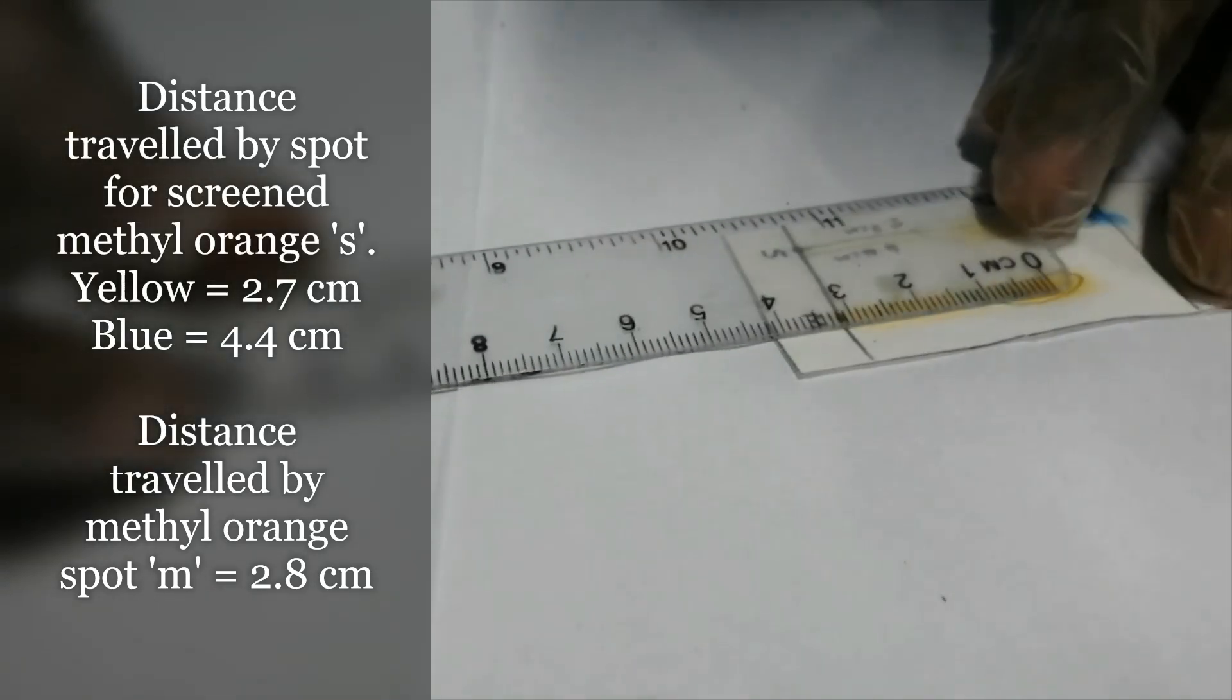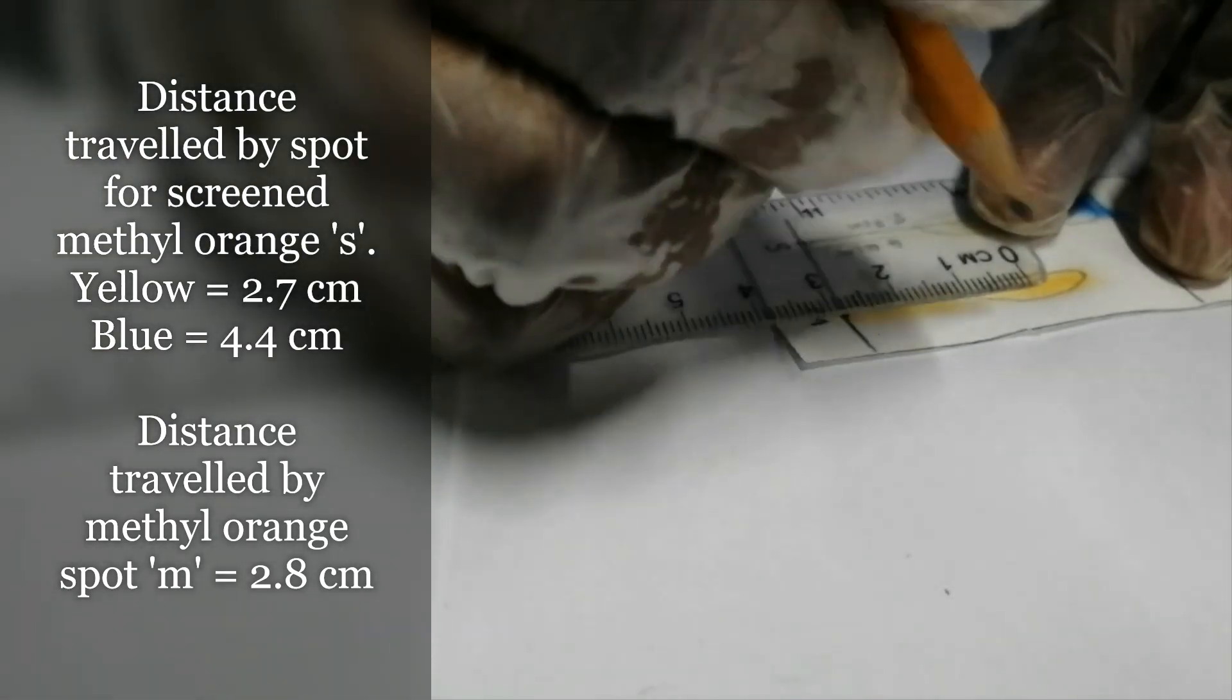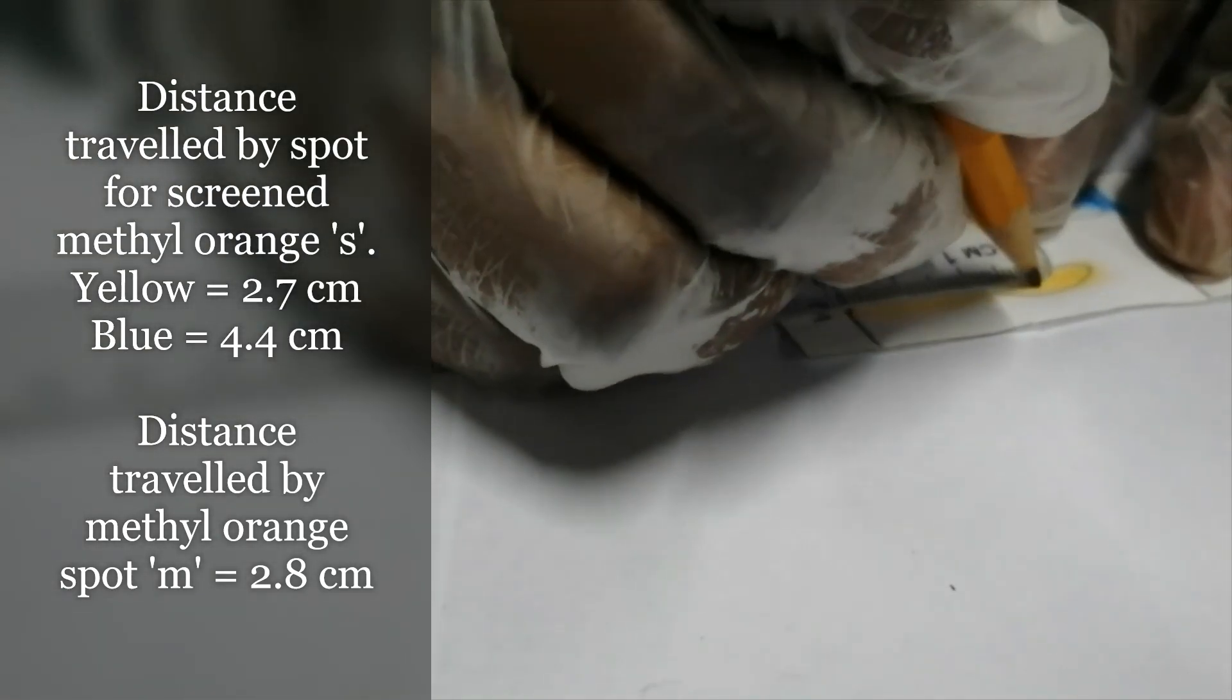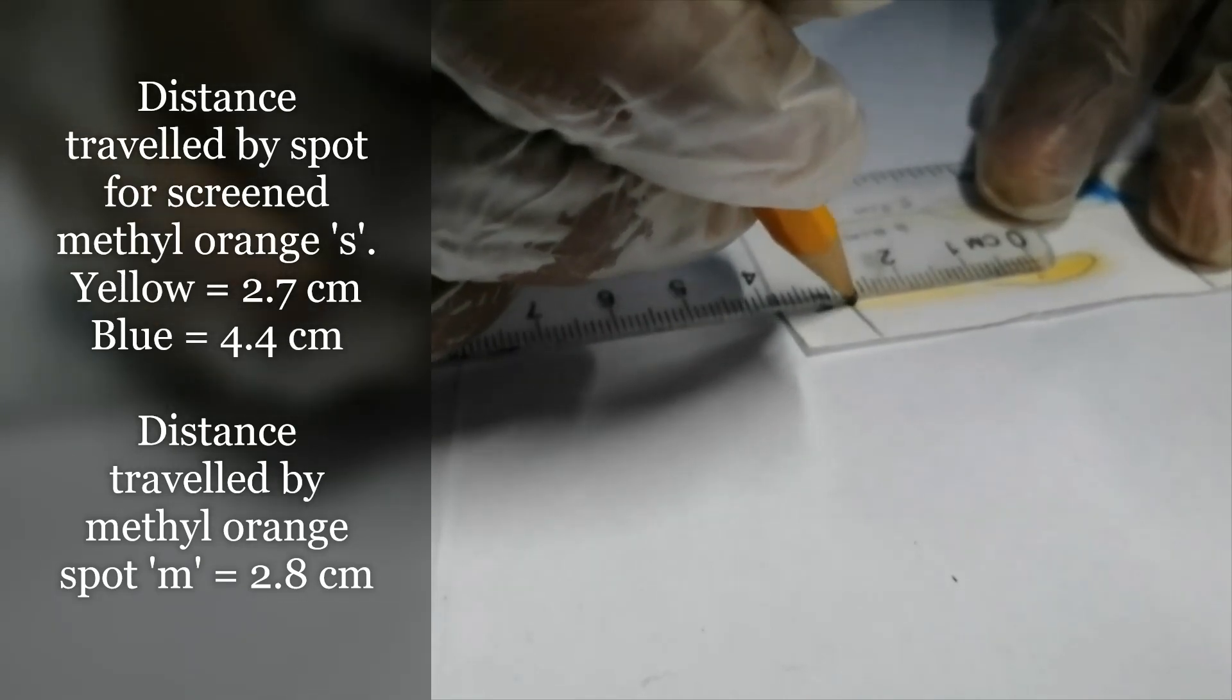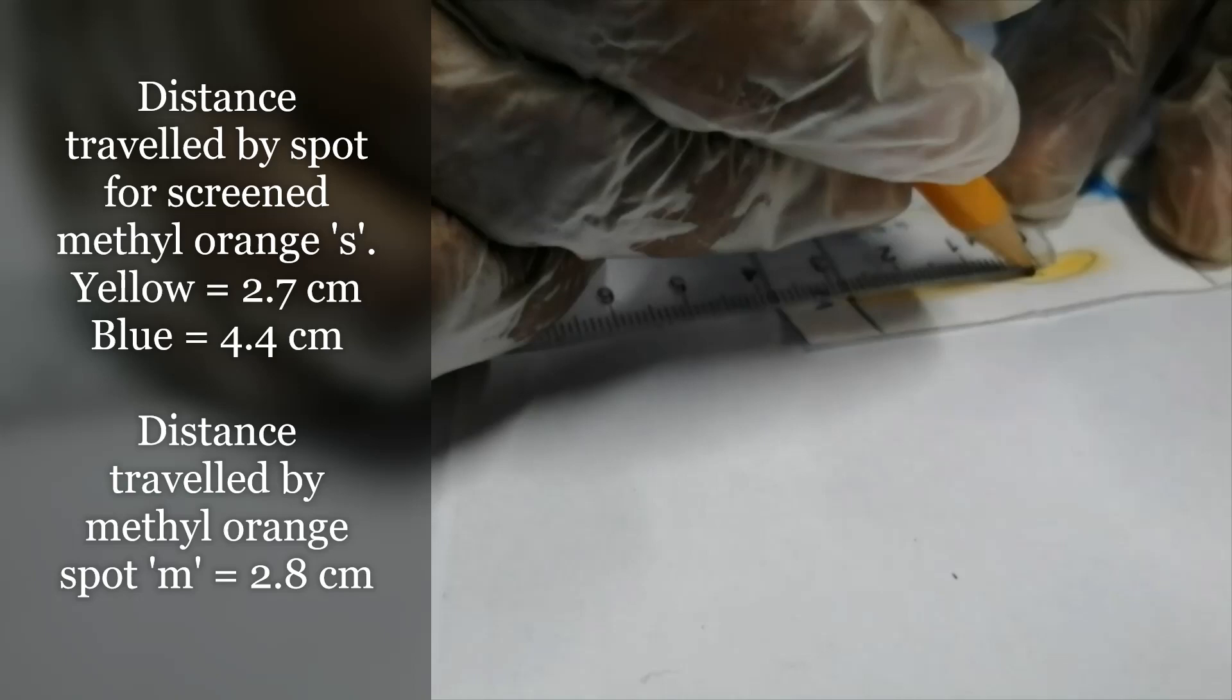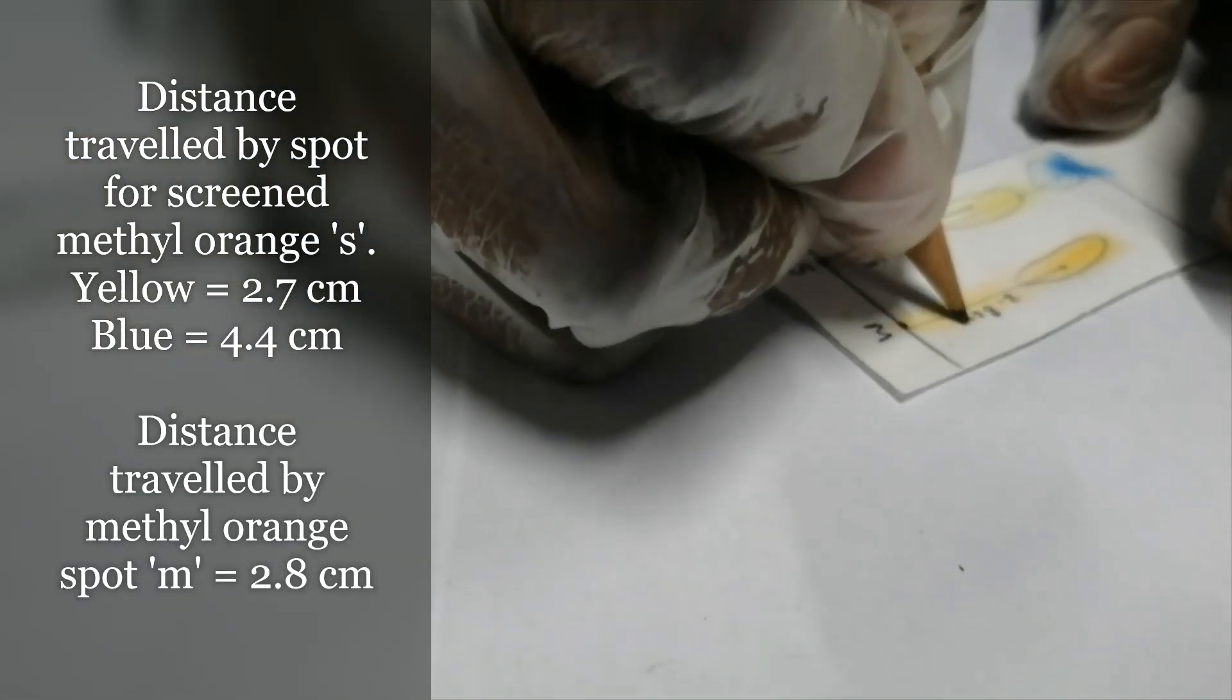For the methyl orange, the center of that streak appears to be here. The distance would be about 2.8 centimeters based on where I decided my center is.